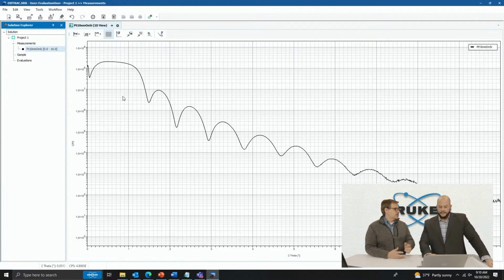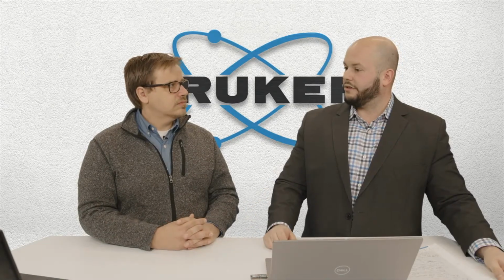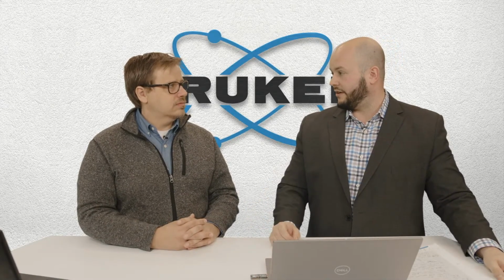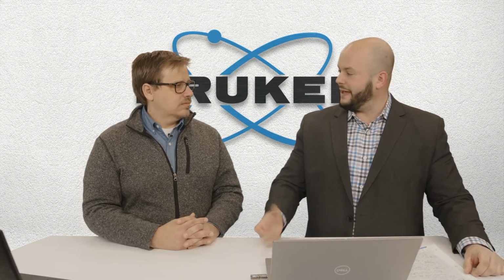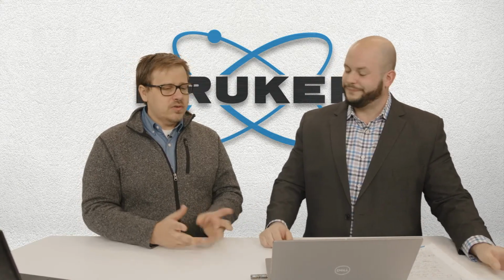How long would a scan like this take? Could take a few minutes, could take an hour, depending on the application. If you're looking at very complex structures like superlattices, where you need the resolution, you have to use a fine slit, or something like a Pathfinder plus analyzer crystal. Then you might have to count a little bit longer. It depends on the situation. Everything from about 10 minutes for something really simple, all the way up to a few hours.